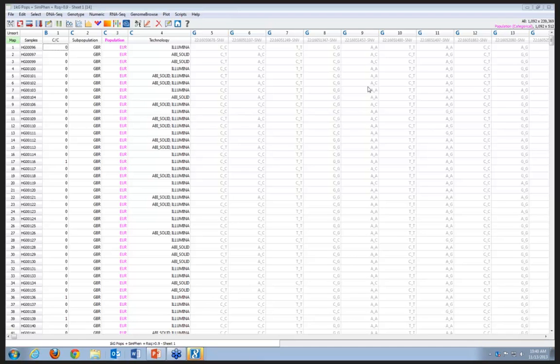Personally, in the imputation work I've done, the thing that I like to use for quality there is actually to look at the genotype probabilities, where you get a triplet of values with a probability for homozygous minor, heterozygous, as well as a probability for homozygous major, and use the probability of the homozygous or heterozygous minor as the basis for filtering. It's really pretty similar to the data you get when you look at dosage, allelic dosage from imputation, but maybe we'll come back to that in a minute.